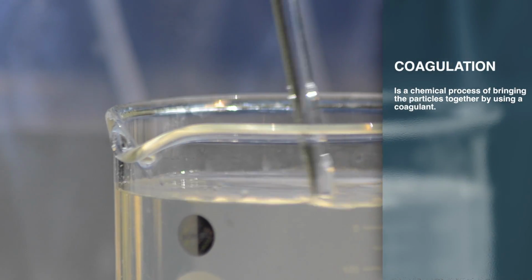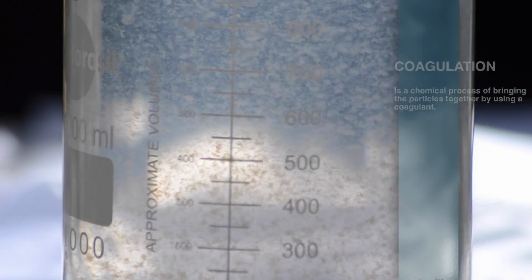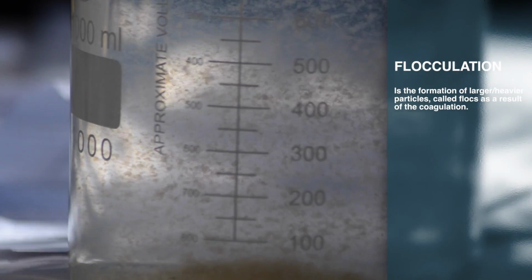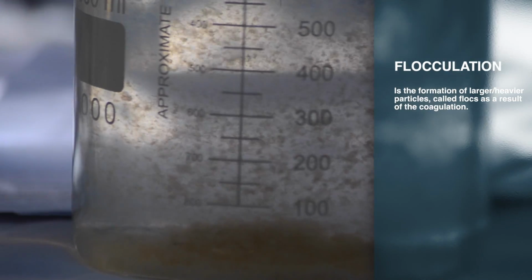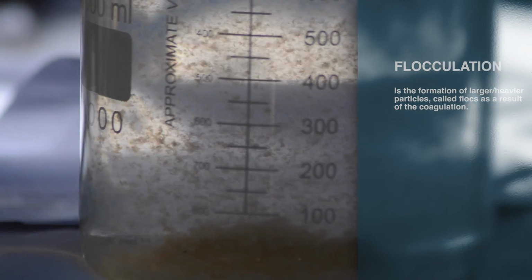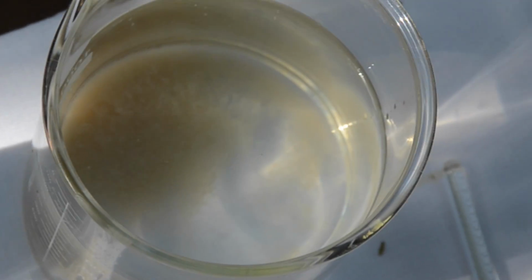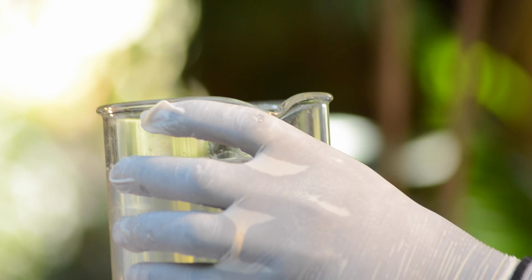Coagulation is the chemical process of bringing the particles together by using a coagulant, whilst flocculation is the formation of larger or heavier particles called flocks following the coagulation. Properly formed flocks will settle out of water quickly in the sedimentation basin, removing the majority of the water's turbidity.